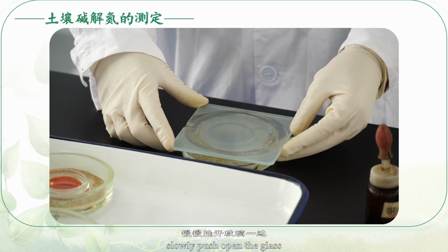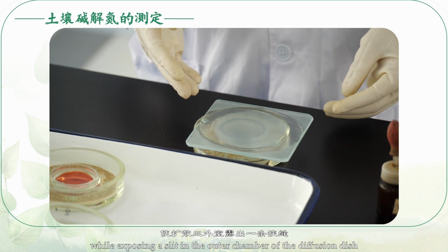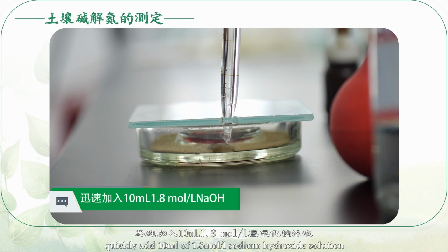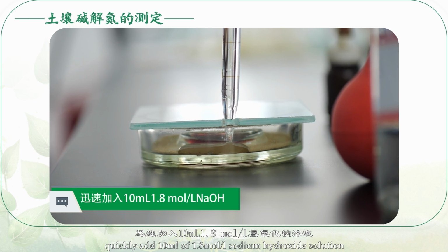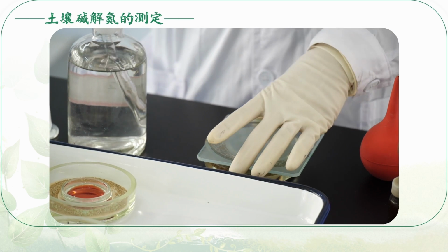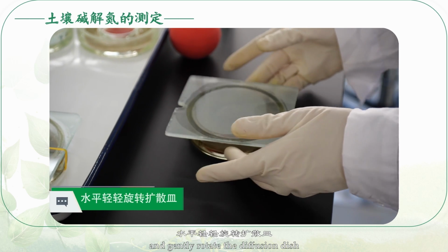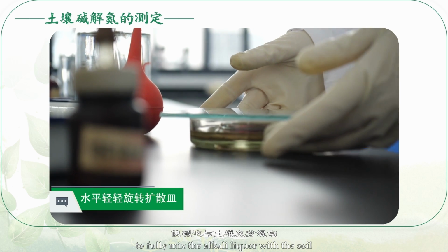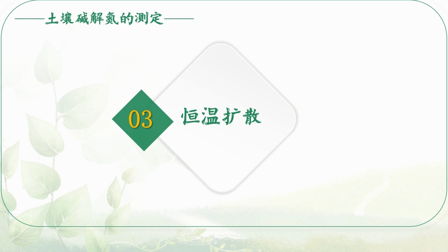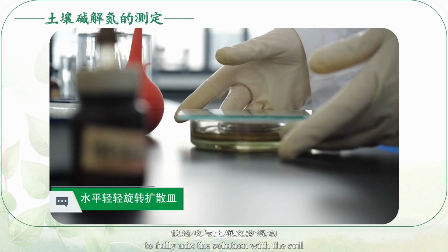Slowly push open the glass, exposing a slit in the outer chamber of the diffusion dish. Quickly add 10 milliliters of 1.8 moles per liter sodium hydroxide solution. Immediately cover the ground glass level and gently rotate the diffusion dish to fully mix the alkali liquor with the soil.